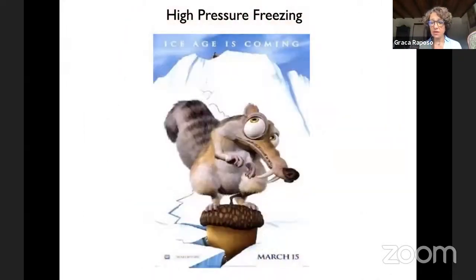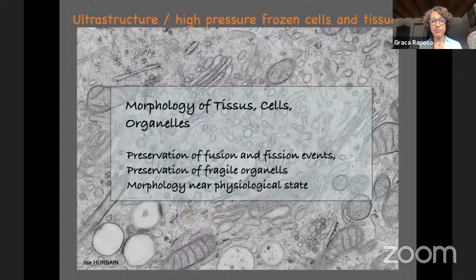And this I always show, it's the high pressure freezing stage. I'll give you a series of examples, because in this case you preserve the tissues better. And as I'll show later, when we want to do, for example, 3D reconstruction, you would like to start on a good base.